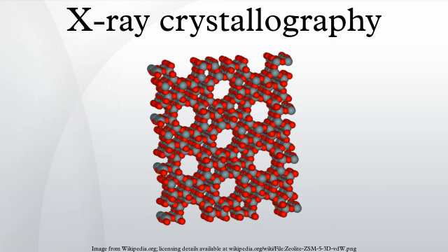Model building and phase refinement. Having obtained initial phases, an initial model can be built. This model can be used to refine the phases, leading to an improved model, and so on. Given a model of some atomic positions, these positions and their respective Debye-Waller factors can be refined to fit the observed diffraction data, ideally yielding a better set of phases.